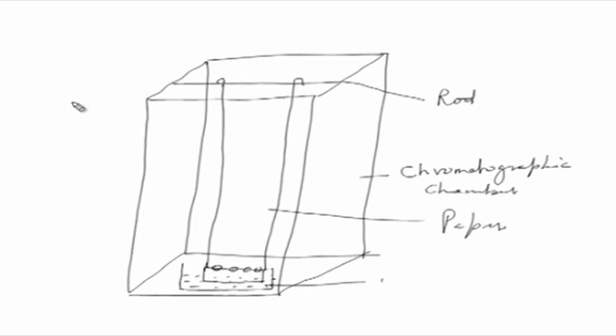This is the mobile phase, which mostly, like I said, is relatively non-polar as compared to water. This one could contain an organic solvent-water combination, and other additives could be utilized, like phenol-water, or it could contain methanol, and a lot of other different types of combinations are available. Once you have placed this, and these are your spots, many spots are being put in here.